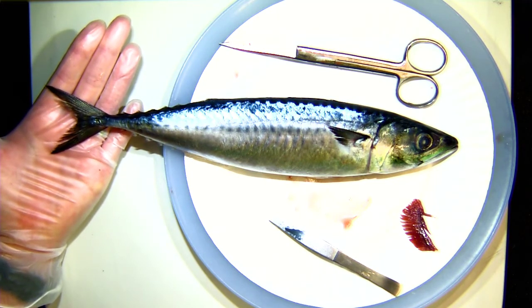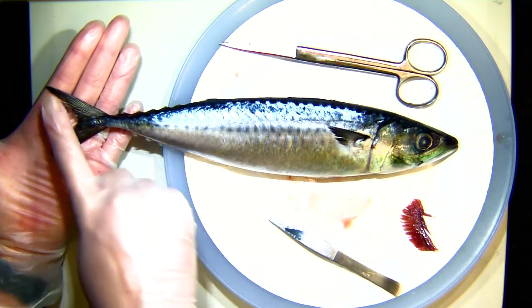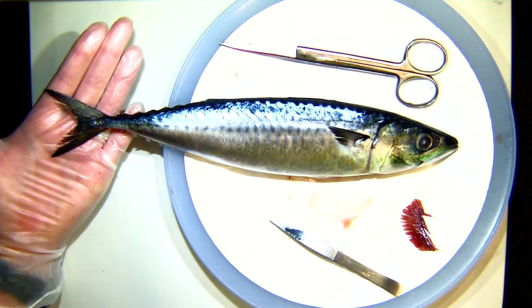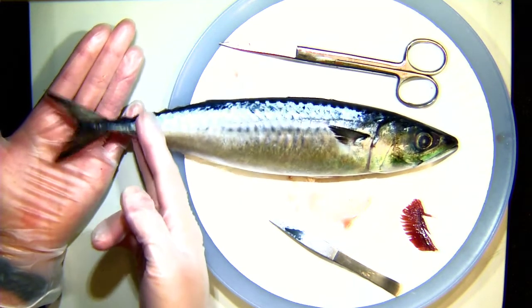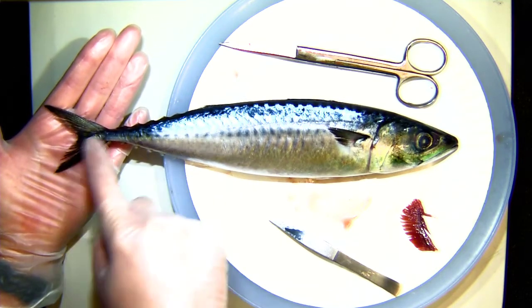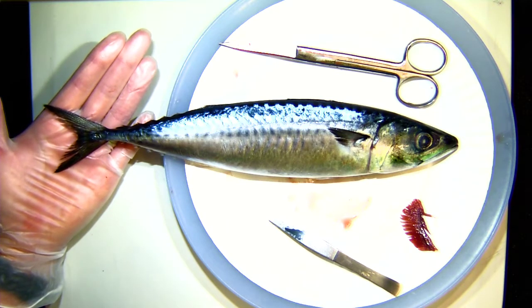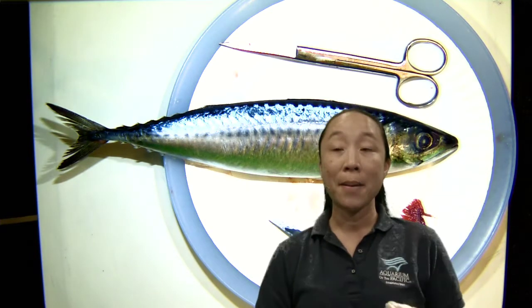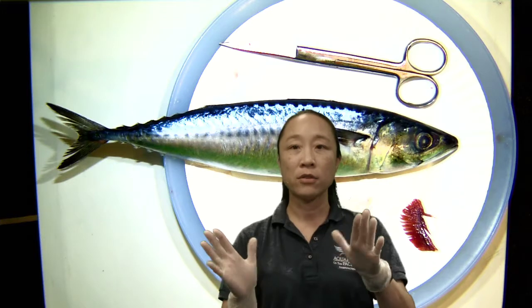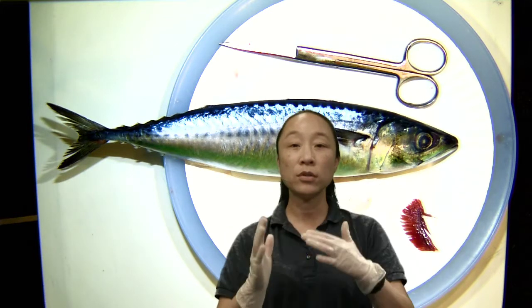Another cool thing about this tail is the shape of it. Do all fish have this shaped tail? Not really. This tail here is like a V-shape, so this fish is going to be a fairly fast fish — able to wiggle its tail really quickly. The V-shape gives it power but also moves very easily through water. Some fish have a tail that looks more like a big fan, or even one that looks almost like a heart. This is the California State Marine fish, the Garibaldi — it has a more heart-shaped tail, so it's not as fast a fish and doesn't have to swim quite as much.